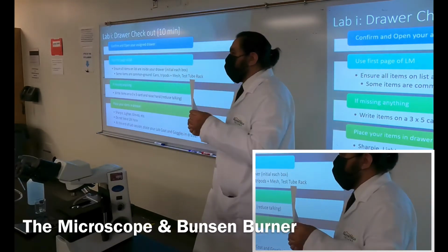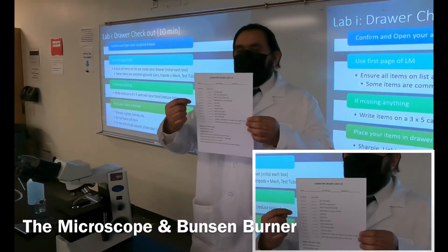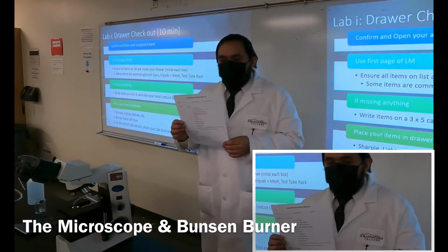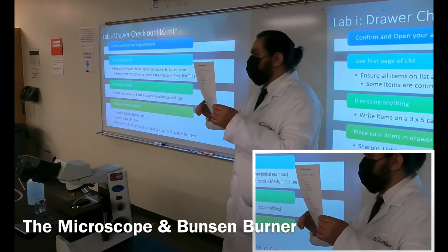And so you want to go through your drawer, just like we watched in the video, and ensure that all the items that are in your drawer are there. And you're going to just initial it so you can turn this sheet to me till the end of the semester. Okay? So ensure that all these items listed here are in there. Just the top, not the bottom. The bottom is your stuff.